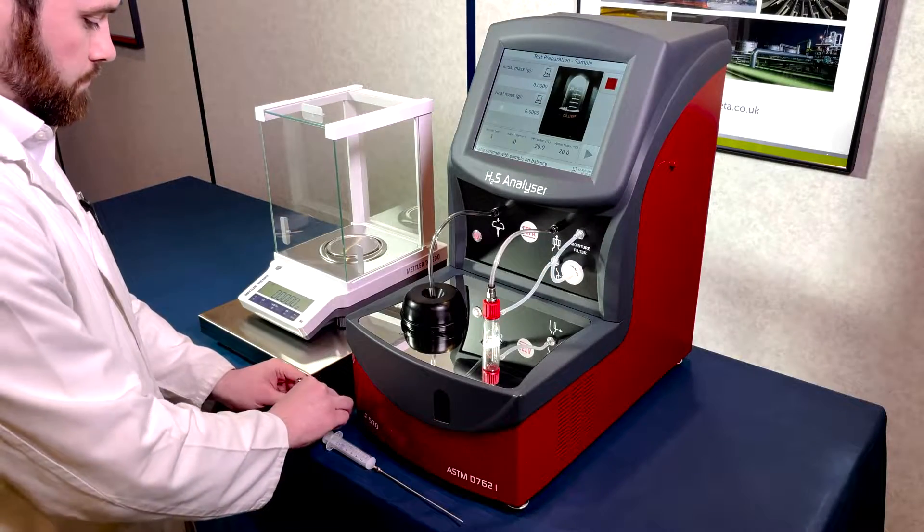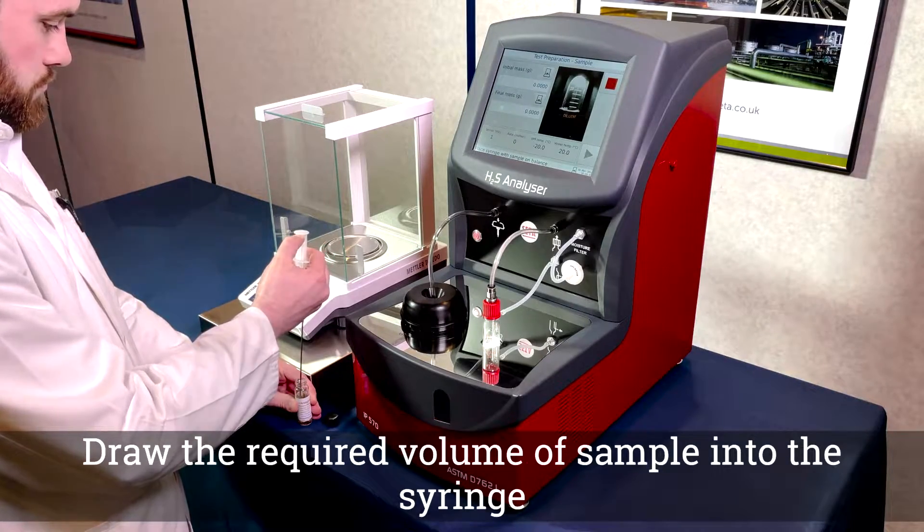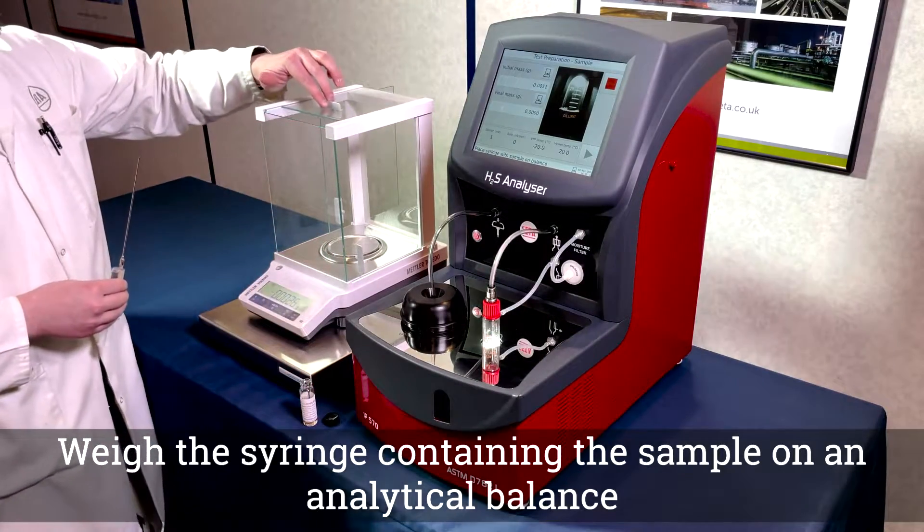Prepare the sample in accordance with the method being run. Draw the required volume of sample into a syringe and weigh the sample to at least three decimal places.